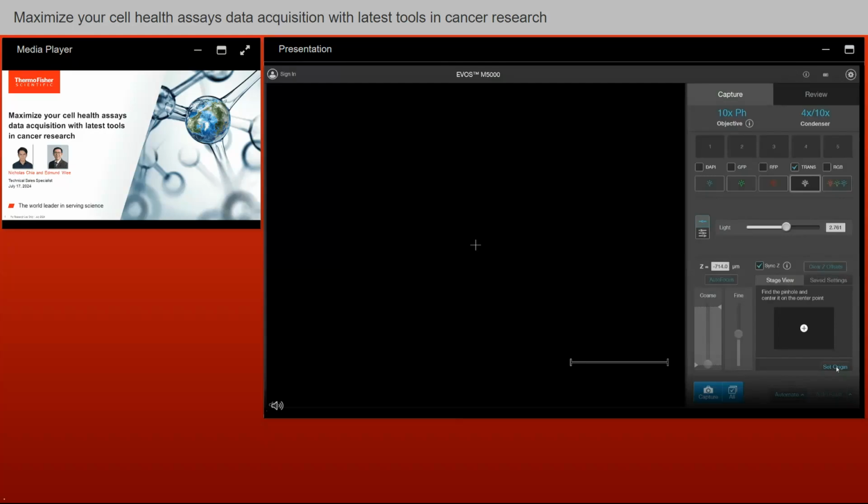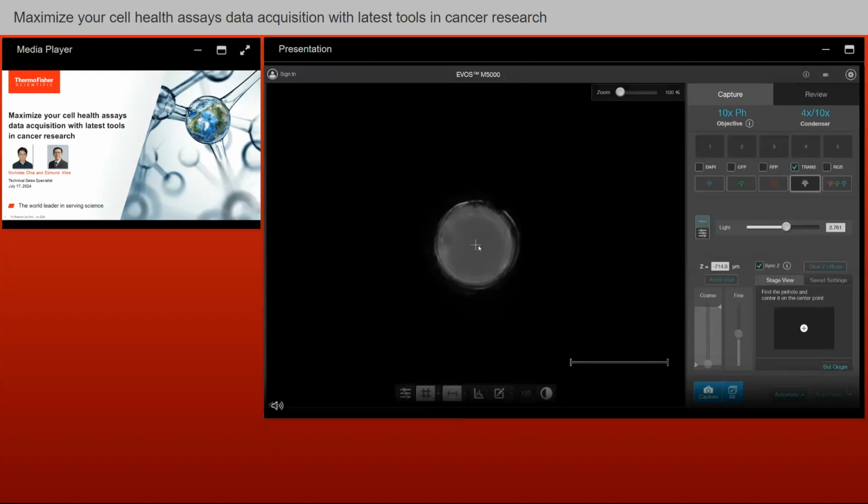So now I'll be placing the vessel holder for the multi-well plates onto the stage, and we'll try to look for the position of the pinhole on the vessel holder to align it with respect to the stage. So you can manually see on the stage itself to find the location where you are nearer to the pinhole with the alignment of the light. Here we are. So you can see that I'm trying to align the crosshair to the center of the pinhole. Okay, so it's around the center now.